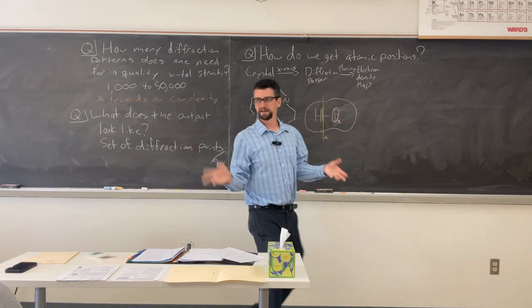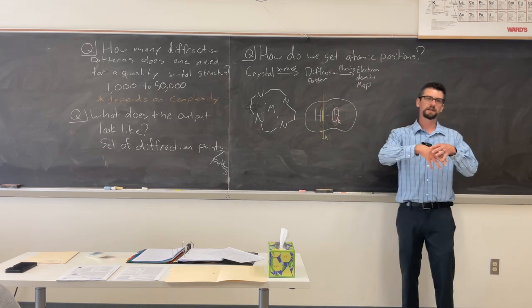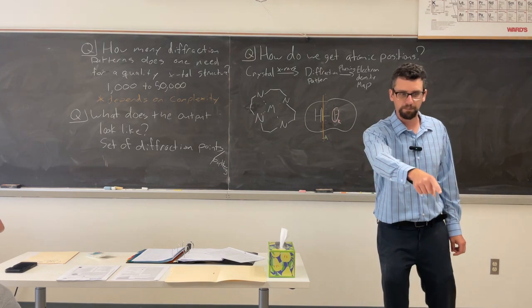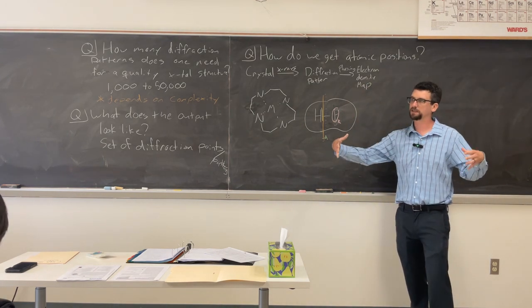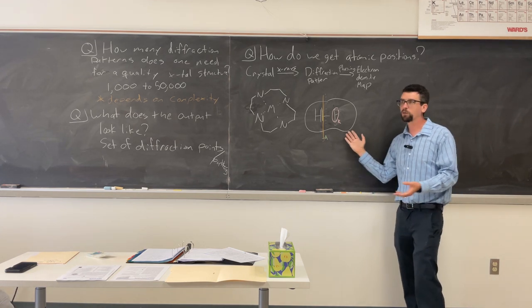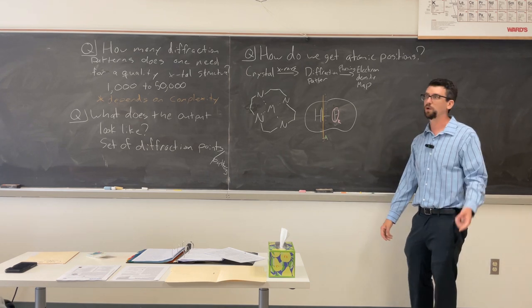Is there a right answer technically? No, it's electron density. Electron density is diffuse. If you look at that map right there, it's showing the diffuseness of the electron density. It shows you where there's more of it, but deciding where things end and begin is very difficult to do with that picture.